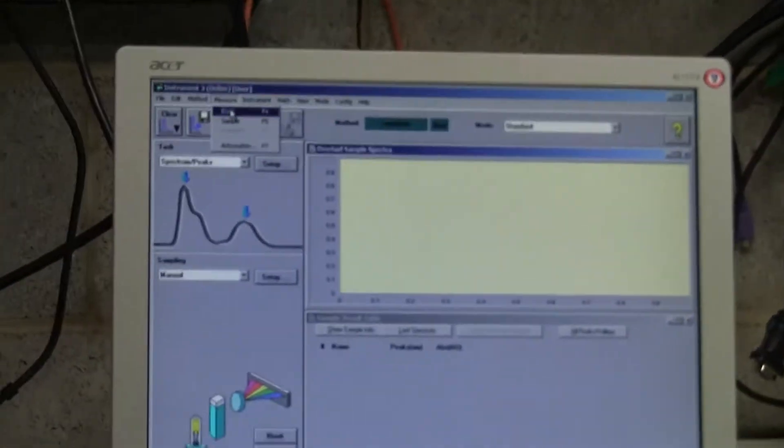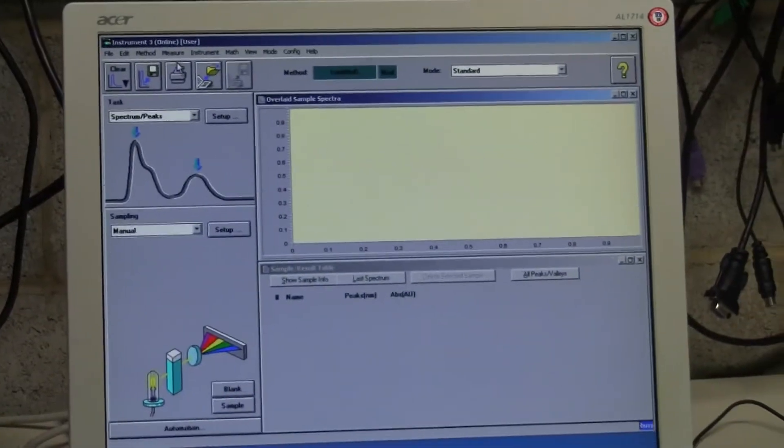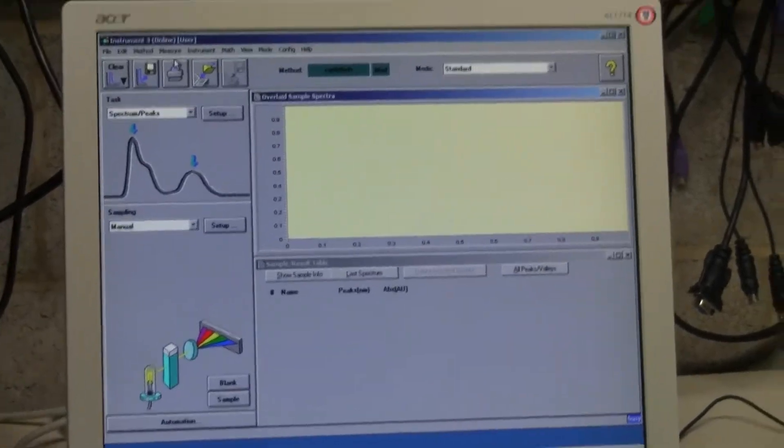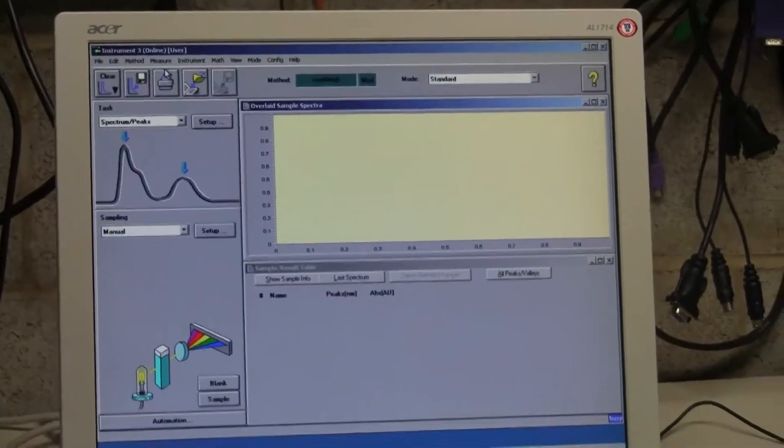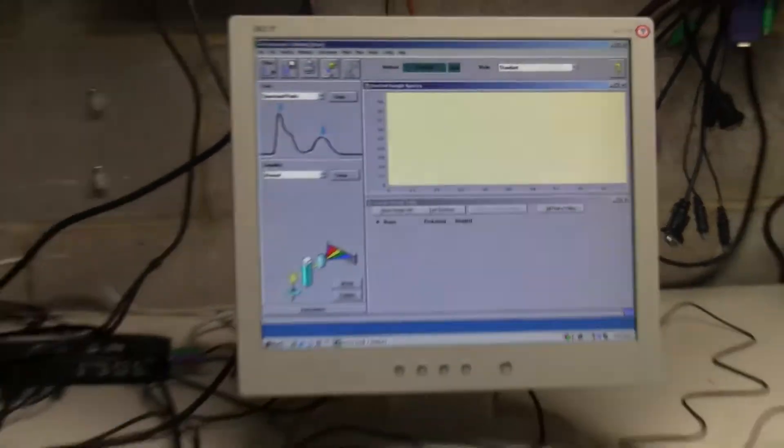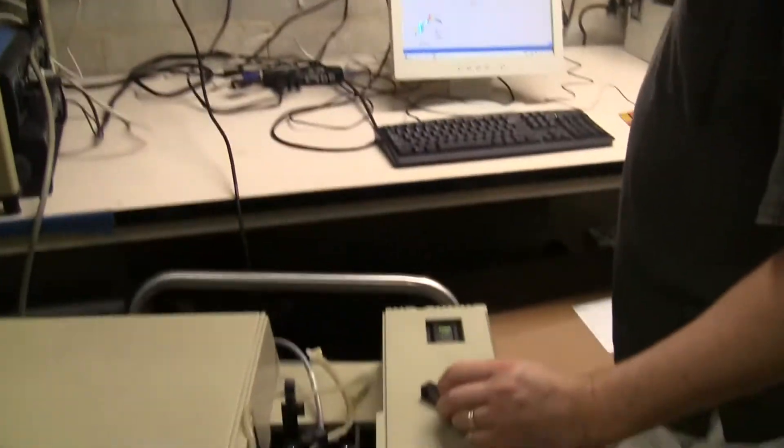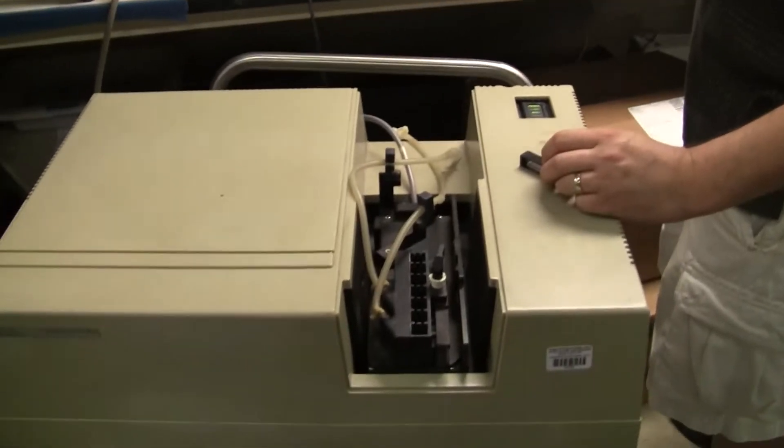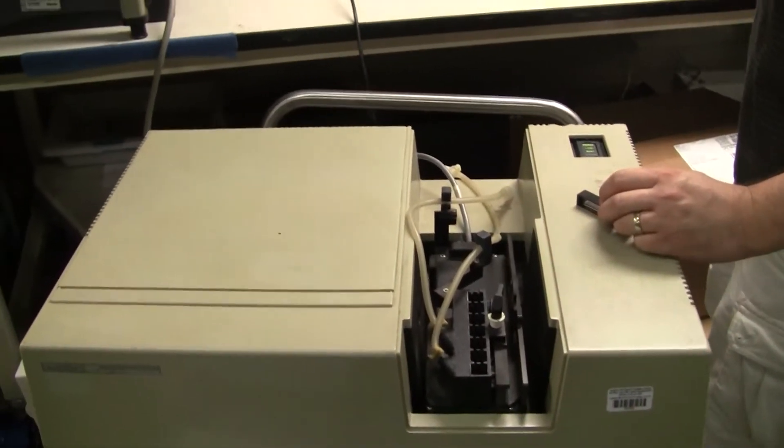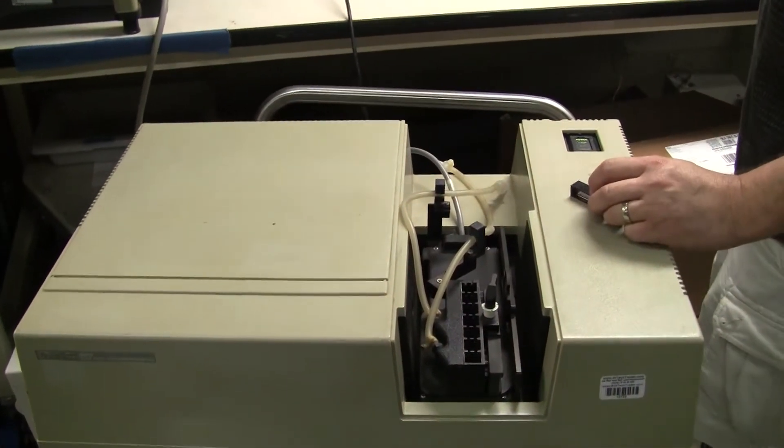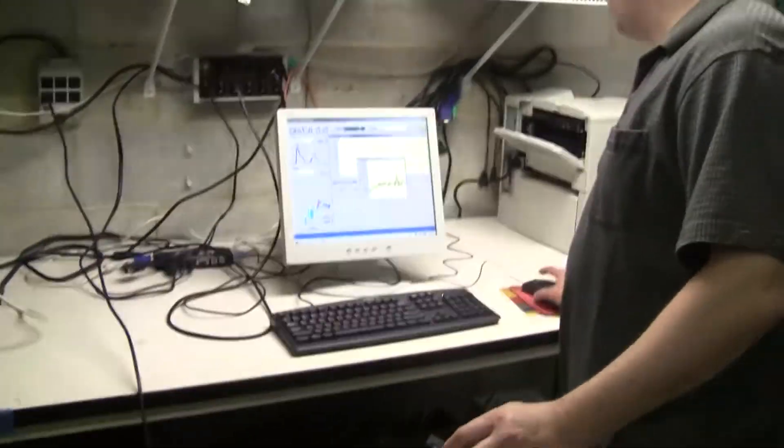First of all, I'm just going to measure a blank. After it's done, great. There's the blank sample.